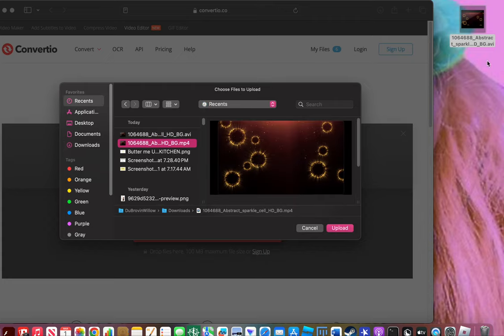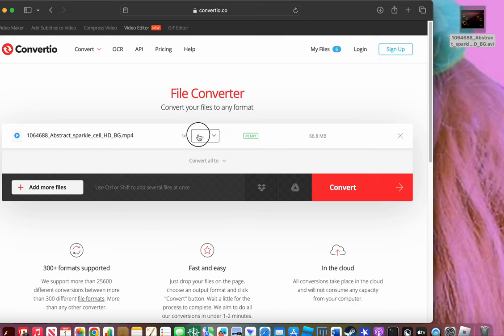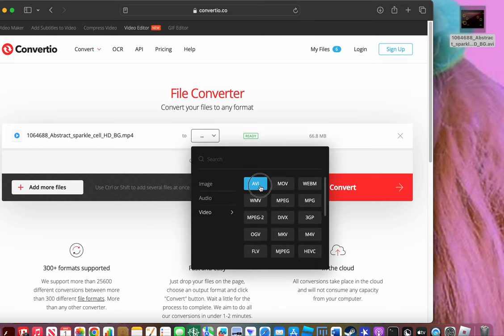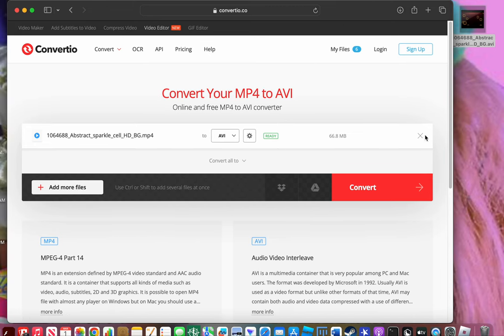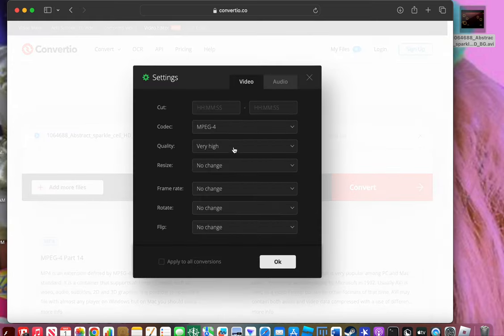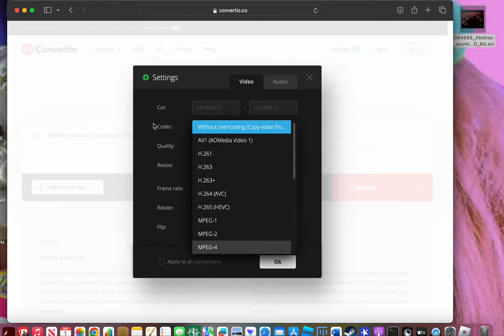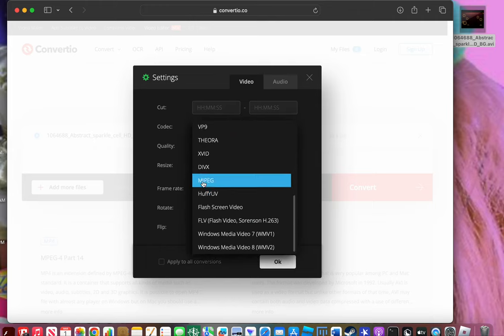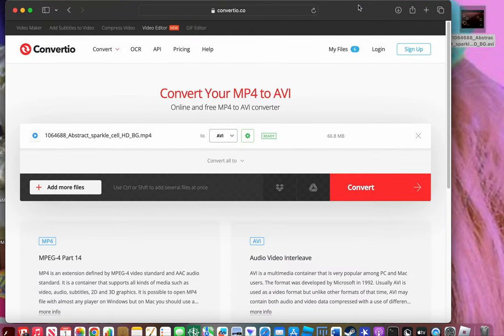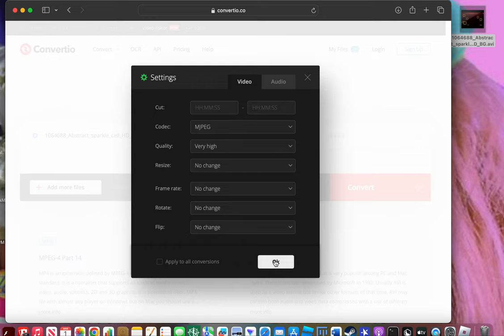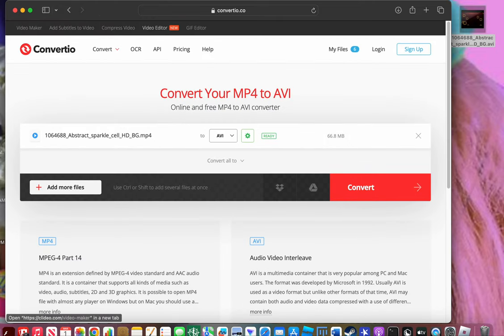Upload your old video and change it to video AVI — it has to be an AVI. I actually got stuck here: you have to go into settings and change the codec. It has to be MJPEG. If you don't change that and try converting without it, it's going to say 'unsupported compression.' I had been struggling with that for days until a friend helped me. Make sure your codec is set to MJPEG, then convert.